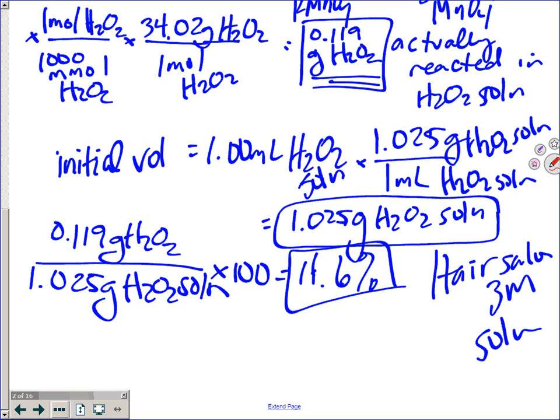Now, do you guys understand your process? All right, I'm moving on. I'm videoing too, but you guys, I do not want to do your data analysis for you. I want you guys to be creative, think through what you're talking about, and then problem solve together. Yes, ma'am. If we dilute our sample, does that make... No, because you still have the initial sample that's got the hydrogen peroxide that was in it previously.